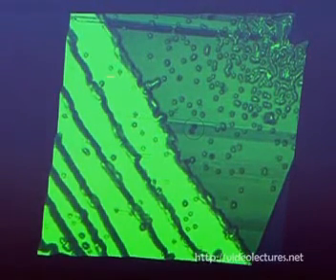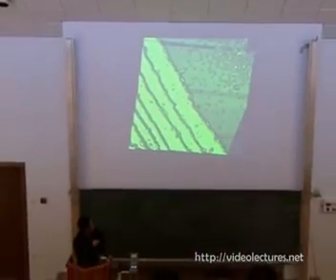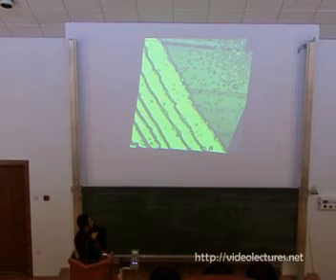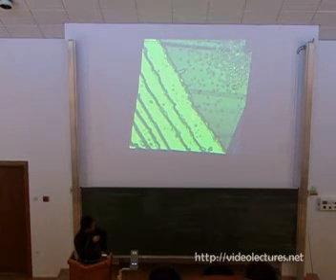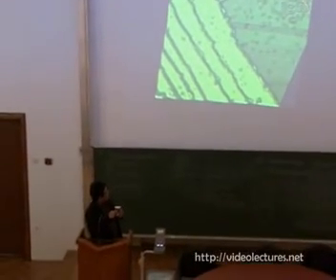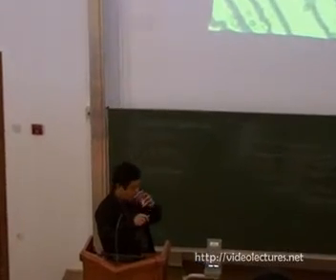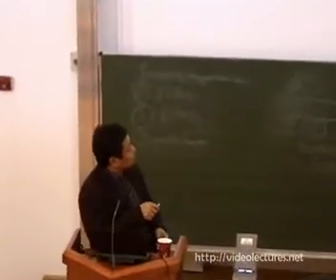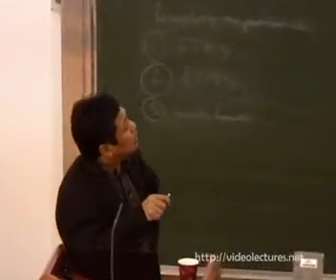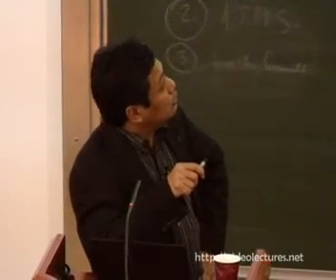So here what you see is the individual atoms, single atom steps on the silver 111, and we have deposited the molecules which are sticking at the step edge here. And then we crash the tip here in this location. These are the debris. This is the crash site, so these are the materials produced from the tip crash. These are two unknown sorbates. Most likely these are sulfur atoms on the silver 111. We use them as a landmark.